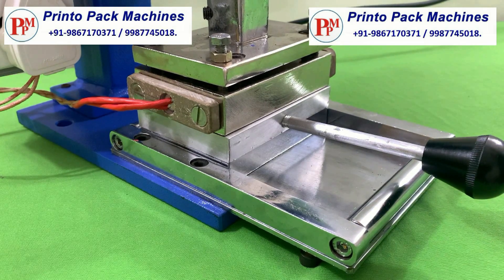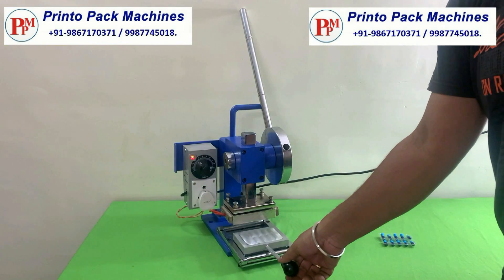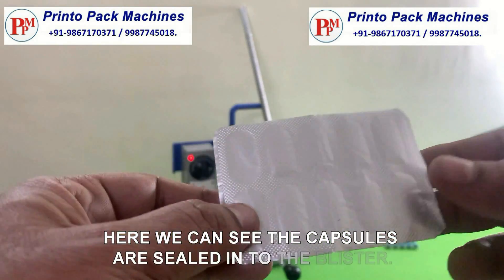We can see the capsules are sealed into the blister. Here we can see the capsules are sealed into the blister.